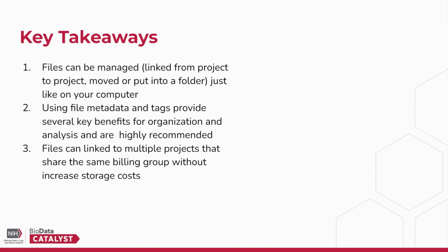Now that you have an understanding of working with files in the cloud, here are some key takeaways to remember. The first is that files can be managed. They can be linked from project to project, moved or put into folders, just like on your computer. Using file metadata and tags provides several key benefits for organization and analysis, and metadata especially is highly recommended. Finally, files can be linked to multiple projects. If the projects are sharing the same billing group, there's no increase in storage costs. So link away.